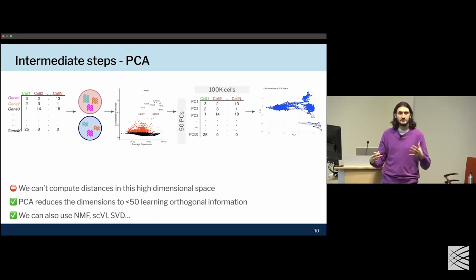Imagine if we start with a data set that's, let's say, a tissue biopsy that has epithelial cells, immune cells, and stromal cells. The highly variable genes will include genes that come from the epithelial, genes that come from the stroma, and things that come from the immune subset. If you then subset to just your immune cells, you need to reprocess it. So now you recompute the highly variable genes to genes that are highly variable within your immune subset. And that will allow you to gain, let's say, an extra layer of heterogeneity to pull things apart. And I'm making a lot of emphasis because I feel like a lot of people miss this step, and it's very, very important to really nail this down.